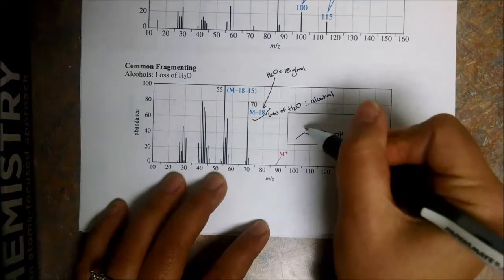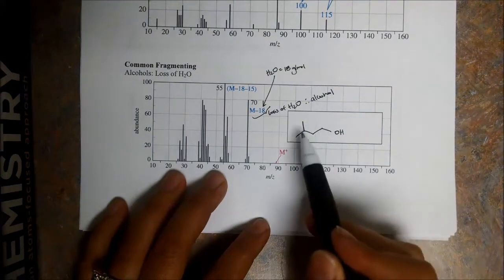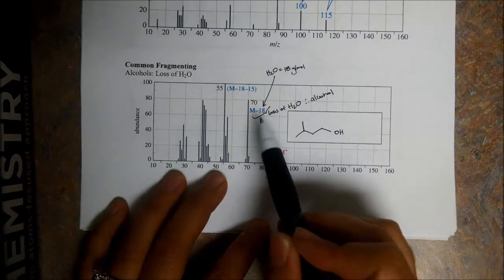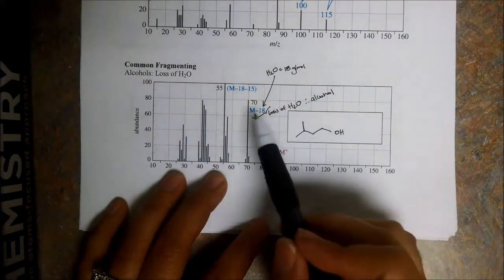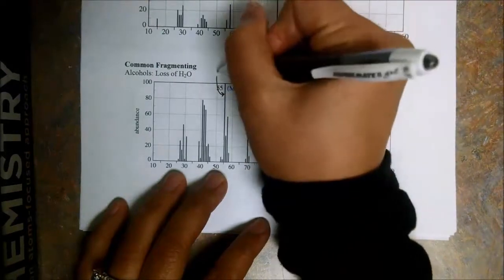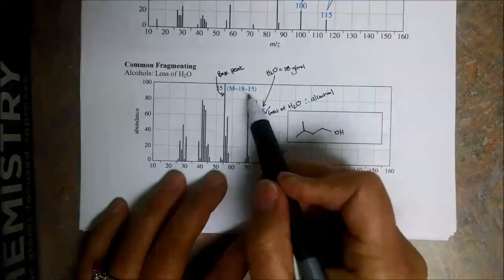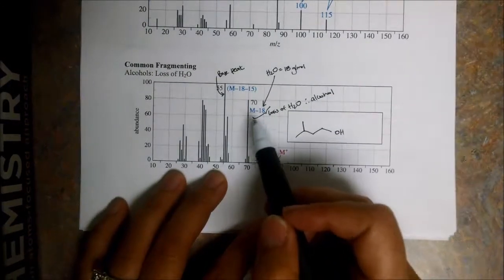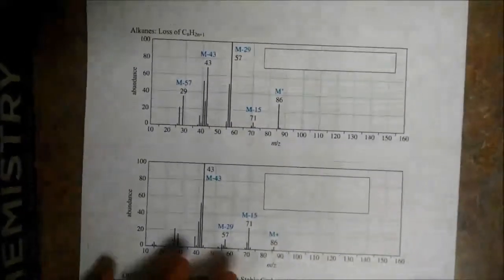This corresponds to this structure, and I definitely would not ask you to deduce the entire structure, but I would expect you to say, hey, we lost 18, this corresponds to water, so we probably started with an alcohol. Notice too, here's the other base peak, the largest peak, and we've lost water here as well, but we've also lost 15. What could that correspond to? We'll see in the very next example, with alkanes.